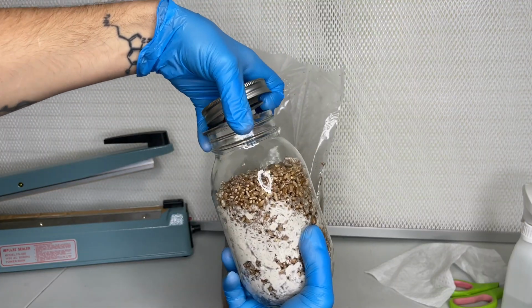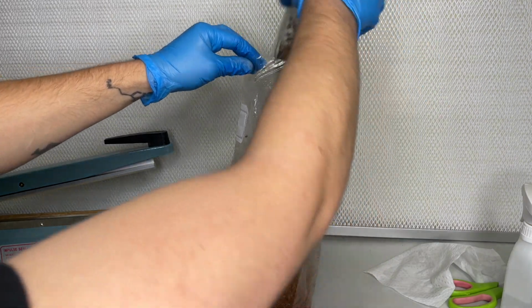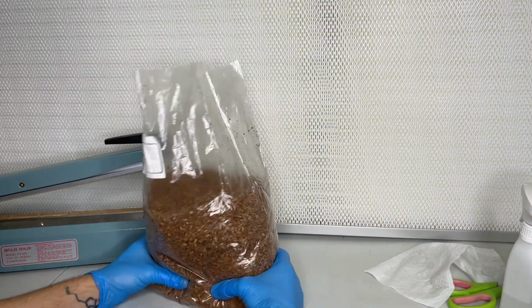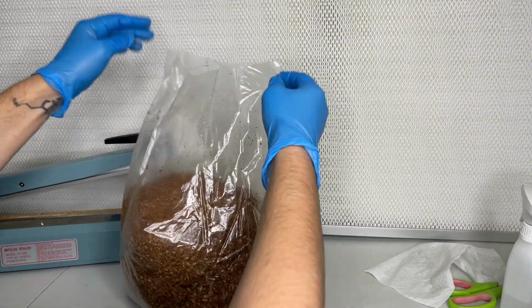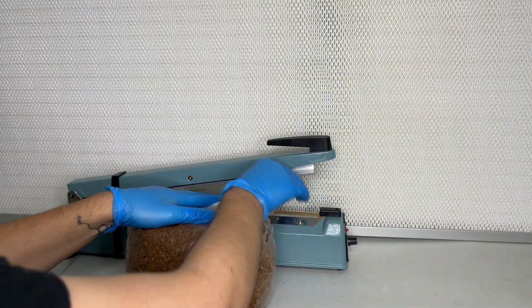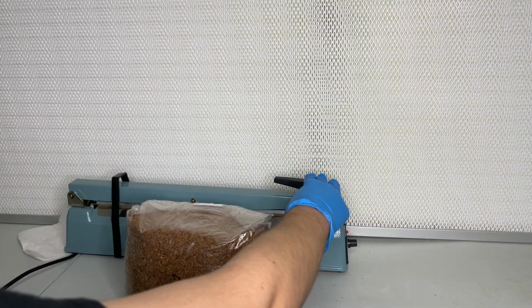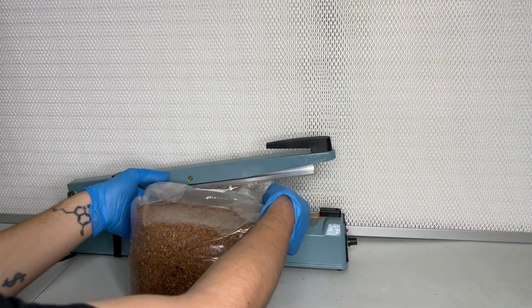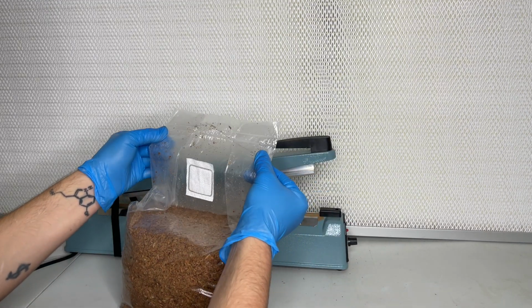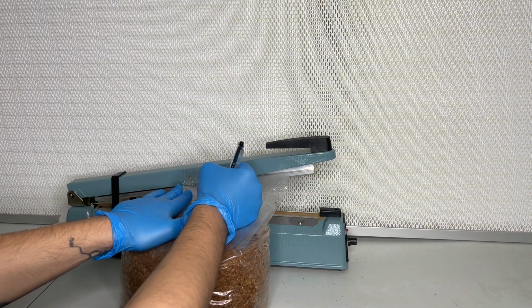The whole quart jar of grain spawn is added to the 5-pound bag of substrate, and an impulse sealer is used to seal the bag. Allow the substrate to fully colonize over the next 2 weeks at around 78 degrees Fahrenheit.